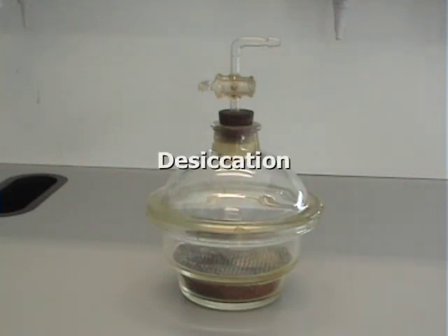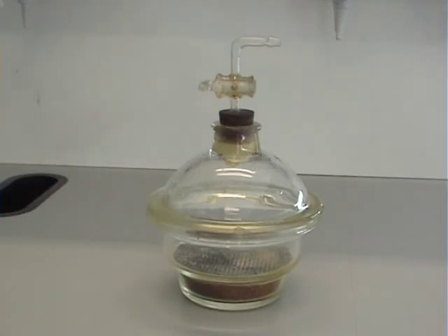Welcome to the inorganic video on drying by using desiccators. Throughout your first and second year studies, all drying will be carried out using a desiccator unless you are told otherwise. This is because many compounds you will work with are thermally unstable, and so drying using an oven is unfeasible.